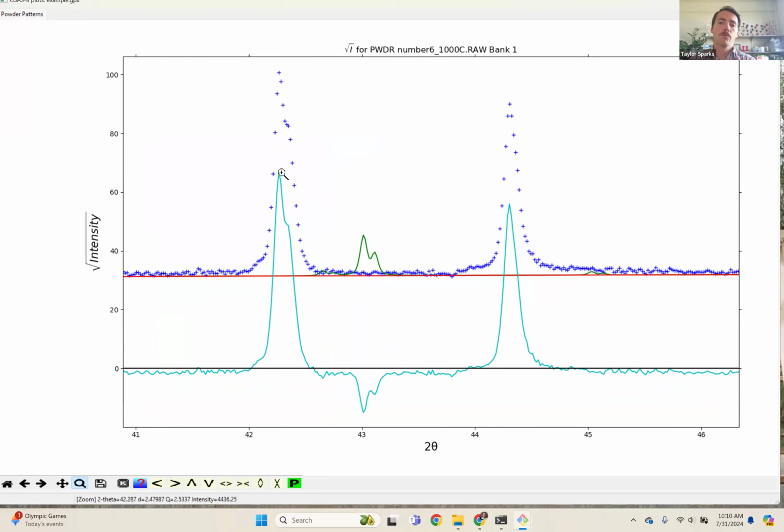So remember, the Rietveld refinement process is going to iteratively change the values of the lattice parameter if I turn on lattice parameter. But if it changes it and makes it smaller, then it's going to move to the right, and then it's not going to find that it's any better. So it might keep on going until it hits this one, which is the wrong peak altogether. If by chance it decided to go left, it might eventually find it. But you're guessing, you're hoping that it's going to choose the right way. And so this is a common thing where it will go wrong, it will diverge.